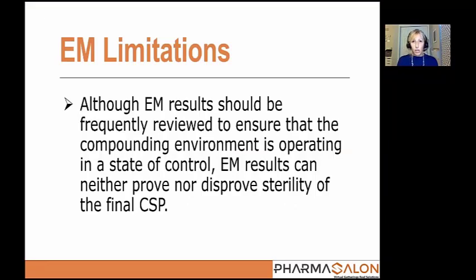So some limitations with monitoring, and this is again important, is although EM results should be frequently reviewed to ensure that the compounding environment is operating in that state of control that we're looking for, these EM results can neither prove nor disprove sterility of the final CSP.